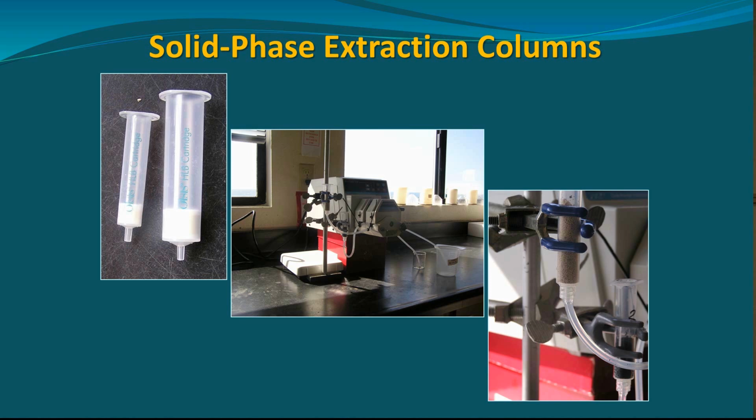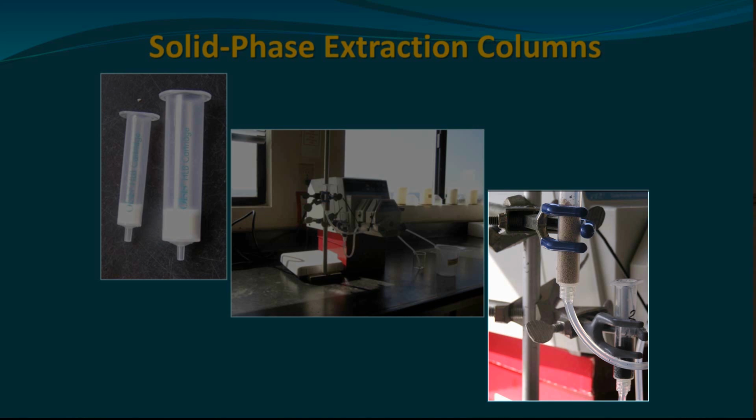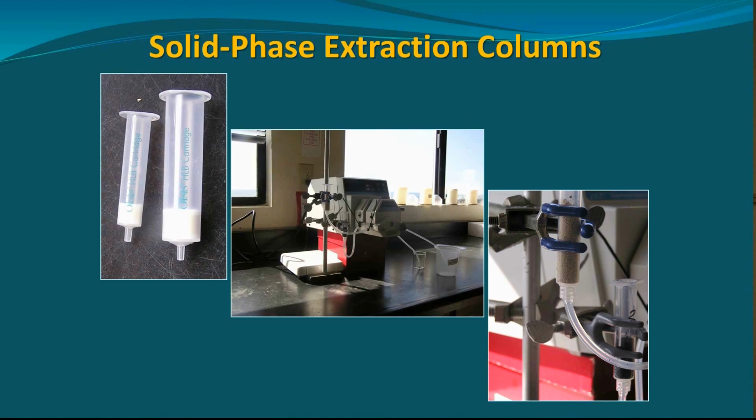And one of the examples I'm going to show you is exactly that. And over here this is another resin type. This is a cation exchange resin that binds things like copper ions or zinc ions. So it's the same thing. Can we trap a sample on this, remove toxicity, elute it with an acid, spike it back in water, and return toxicity? That's indicative of some metal. Sometimes we'll combine these columns, we'll do them in a series, if we suspect it's metals and organics in the same sample.